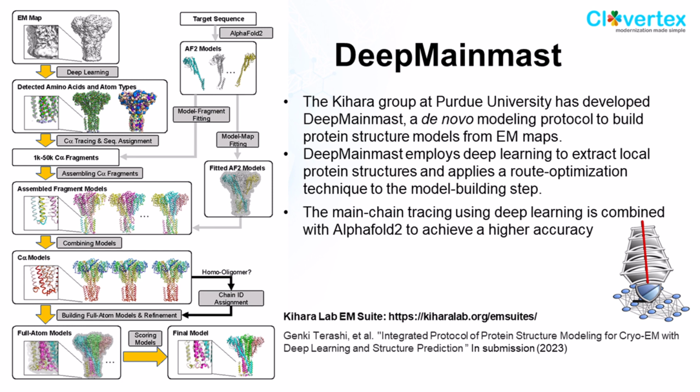An important thing we implemented is actually AlphaFold. As you know, AlphaFold has been very successful in structure modeling, and that is also very useful for cryo-EM structure modeling. So we do the AlphaFold, but as I show you in the next slides, AlphaFold structure is not always perfect. Actually, there are small shifts, and then domain orientation can be very wrong in AlphaFold models.